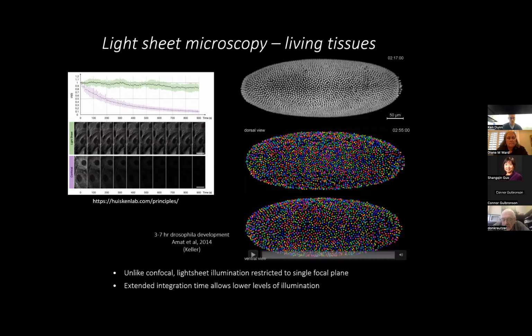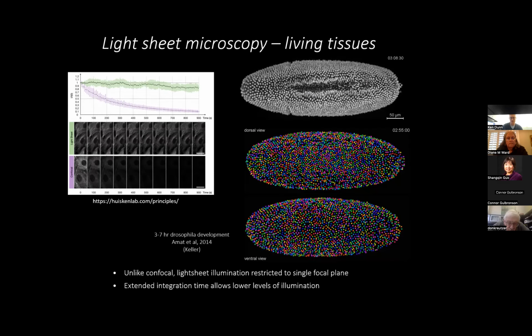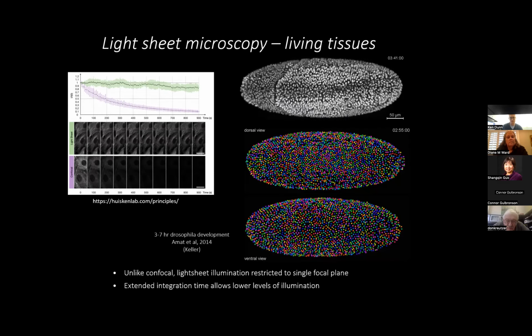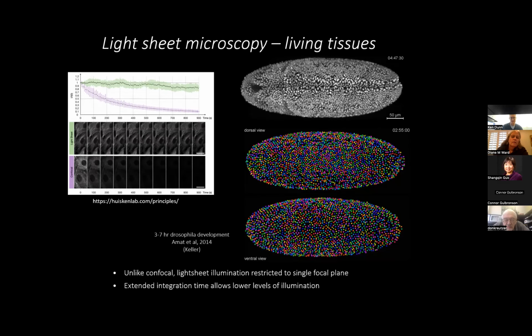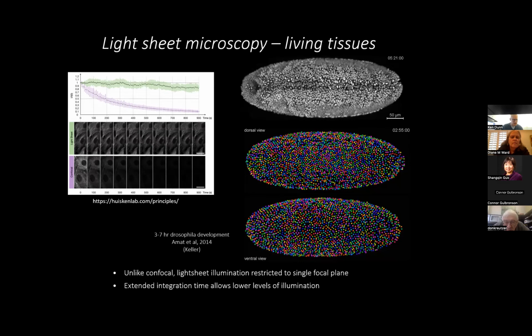What this has been used for is long-term studies of things like Drosophila development. So this is an example. I believe this is actually from a 3D volume. This is from 3 to 7 hours, looking at, you'd like to think I'd know what this is.